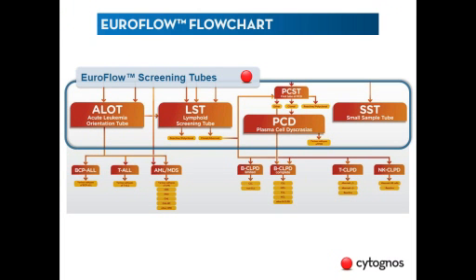You can see now in this slide the EuroFlow flow chart, the classical workflow designed by the EuroFlow people. This is also placed in the paper, and this is the heart of EuroFlow. Depending on the suspicion that we have, if your sample comes to your lab with a suspicion of acute leukemia or a lymphocytosis, or you suspect some problem with the plasma cells, or you are receiving a small sample like CSF or vitreous, you are going to apply one of the 4 screening tubes.